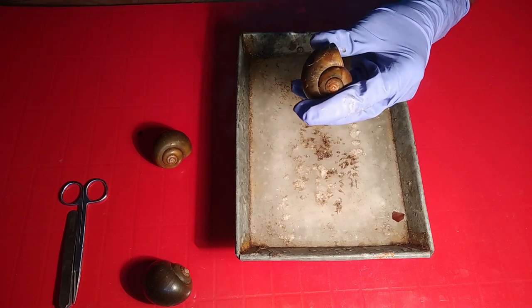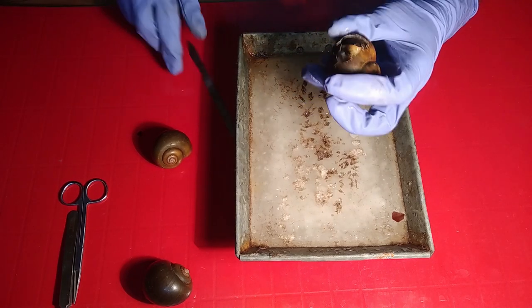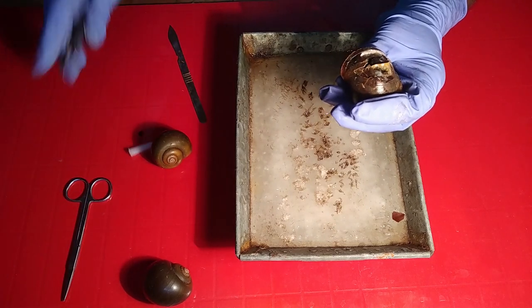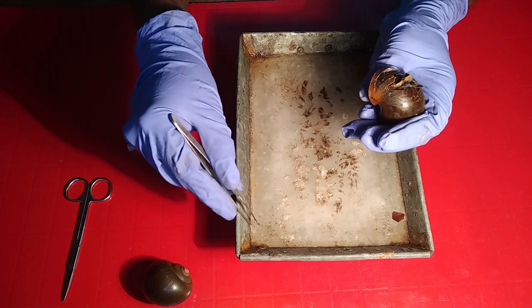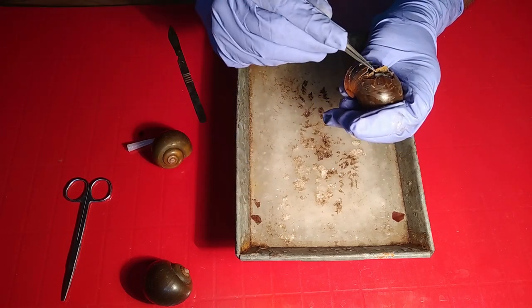They are very much soft-bodied animals. They used to have an amphibian pattern of respiration. A soft membrane mantle is there and the mantle cavity — oxygen remains dissolved in the water. Slowly we remove all those cells; they are very much soft-bodied animals.